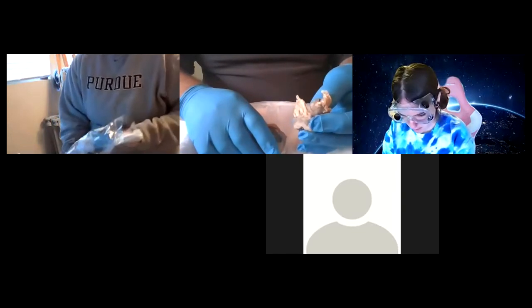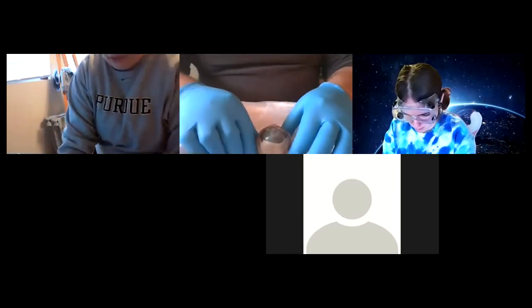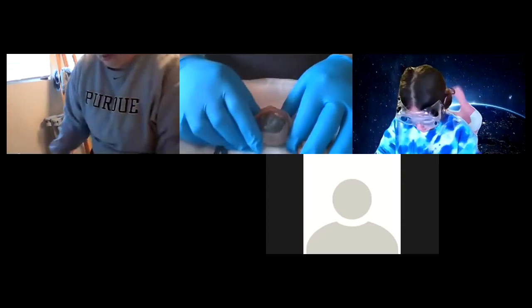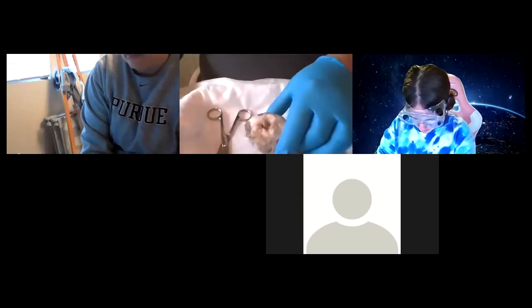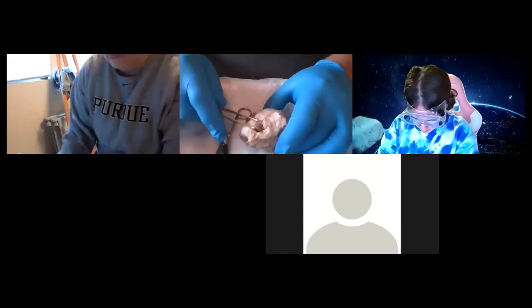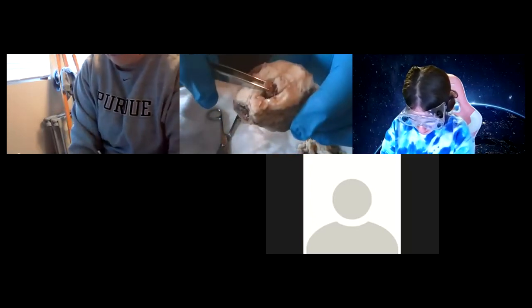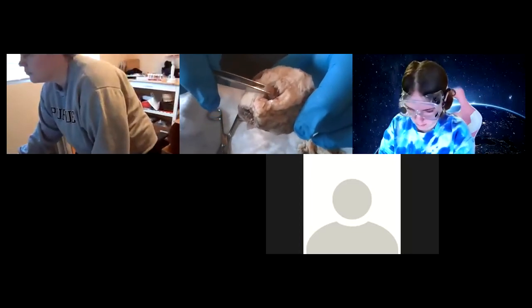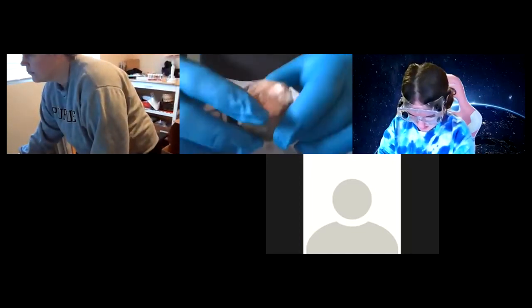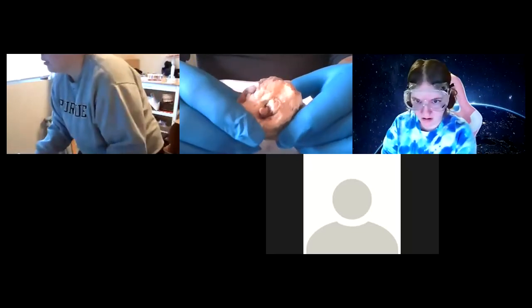Now I cut off this connective tissue. It has a lot of fatty tissue in the socket of the eye — in the cow, and in the human. Basically, you want to see the back of the eye and the optic nerve. Take a look at that. Feel it with your hands — feel that nerve tissue is different than the connective tissue. This is a good chance to finally feel the difference in tissue.